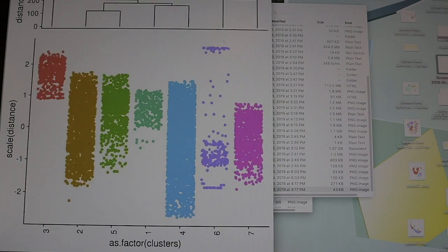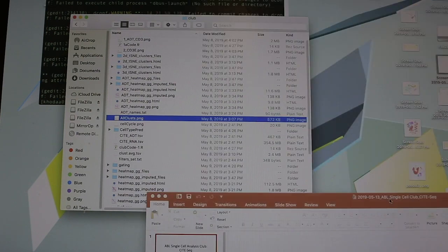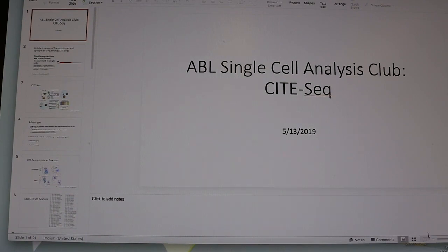Can I ask, does the package also work for hashing or only for CITE-Seq? So we have a function for hashing that would predict, based on percentage, which condition each cell would be from, and then you can use that. It works fine, right? Yeah, I have a slide about that. But hashtagging with CITE-Seq antibodies, I'm not really sure about other methods. The hashing is like on or off. It's not like an expression level like the CITE-Seq barcode. Is it there or not?